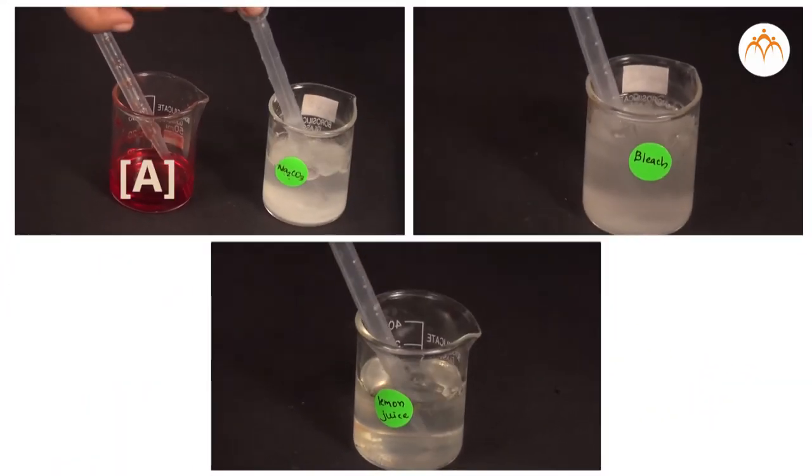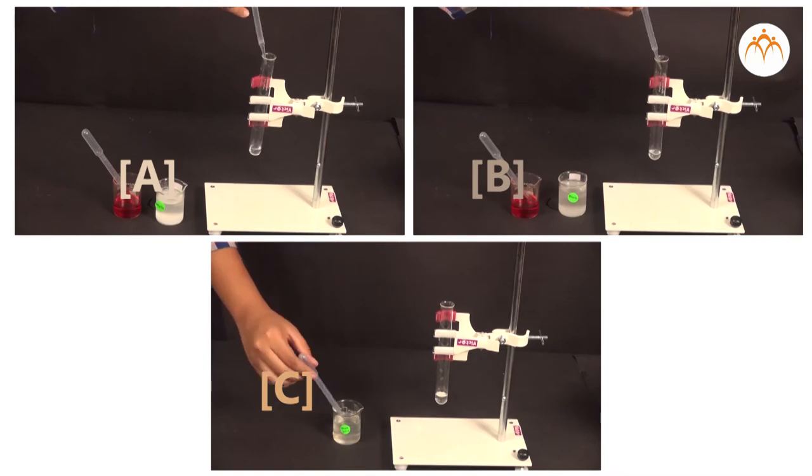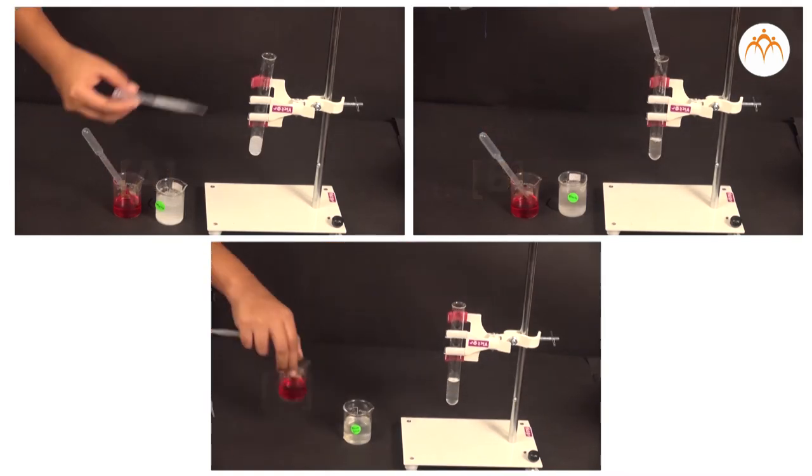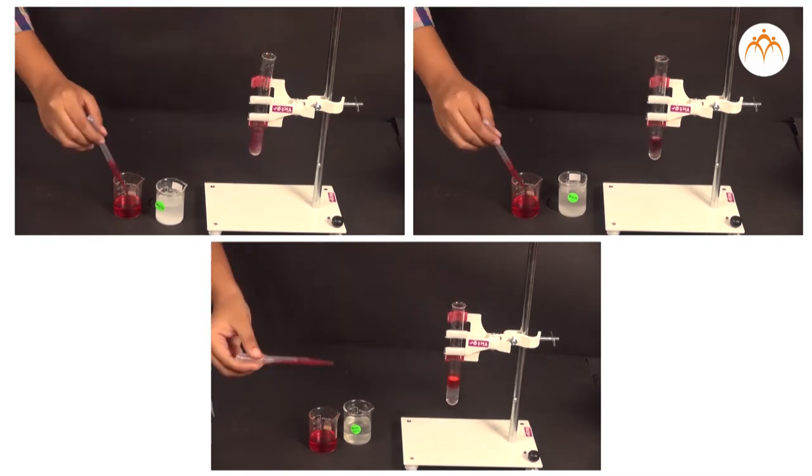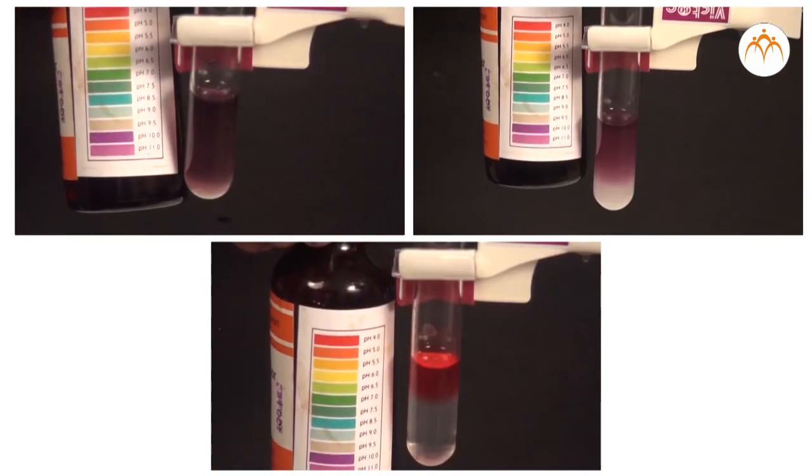We are taking solutions A, B, and C in 3 test tubes respectively. We tested the solutions with the help of any one of the indicators and noted the observations in an observation table.